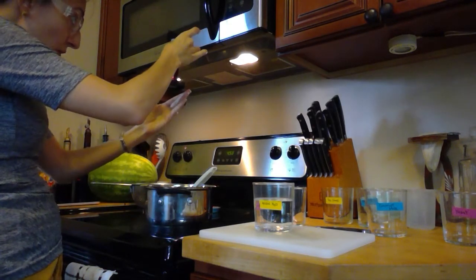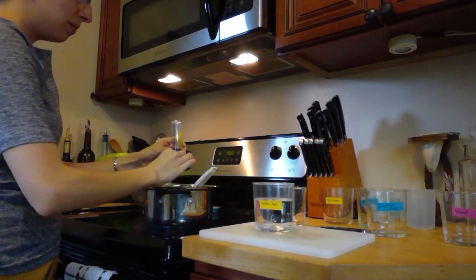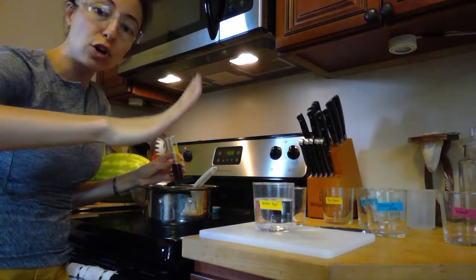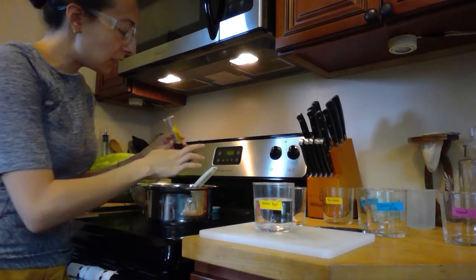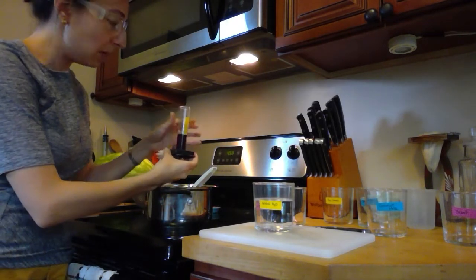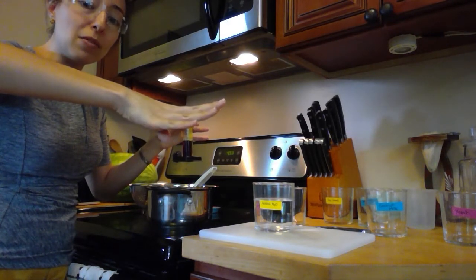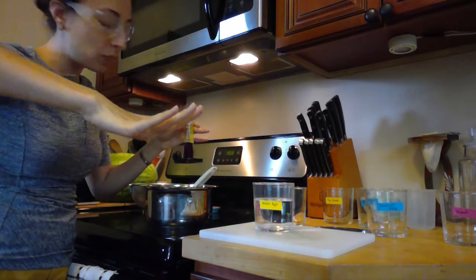Okay, now you have a nice graphic on how to eyeball exactly the 25 mark. And if you look at your procedure, it says that what you want to do is look for the meniscus. So the meniscus is a curve of liquid. It usually happens with water and other thicker viscous things, especially because water has all those neat tendencies we talked about. And so when you see a curve in any kind of liquid that you're measuring, you actually measure it from the bottom of the curve, okay? Not the top portions, but the bottom.